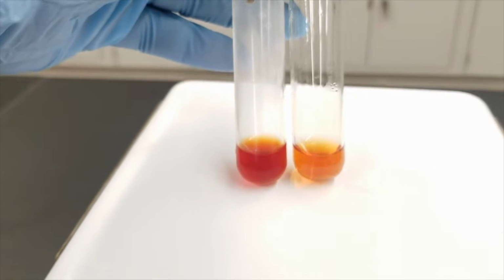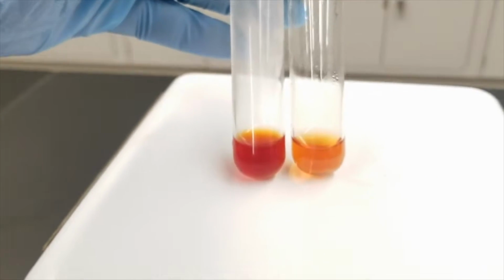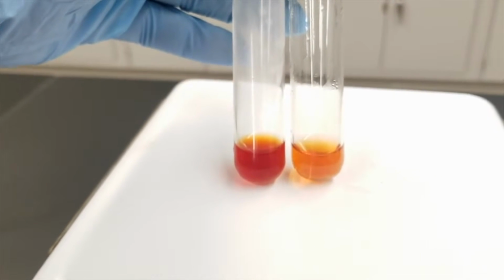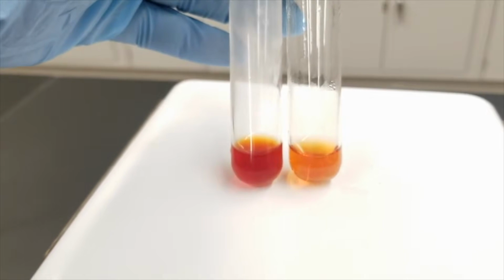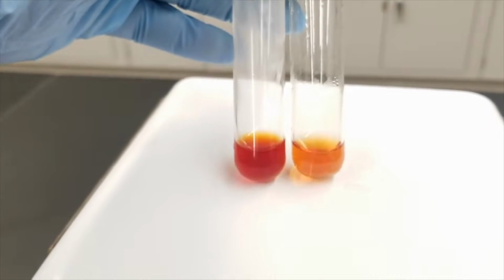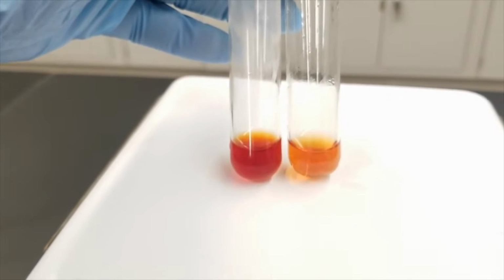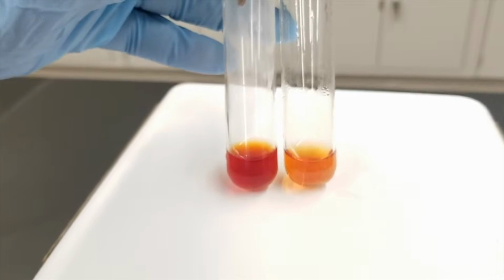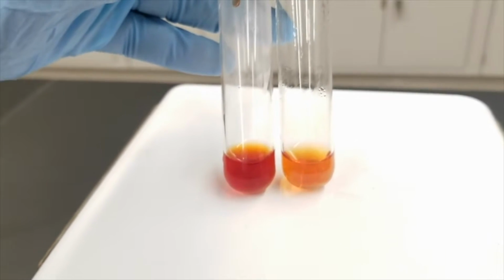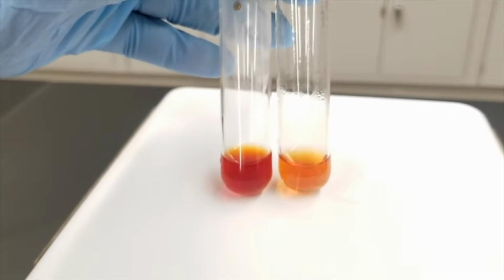So even though one of our test tubes hasn't gotten as dark as some of the other test tubes, I will point out that one of our reactants at least, iron 3 nitrate, is that sort of yellowish color, and our product, the iron thiocyanate complex, is a deep red color. So based on that, you should be able to figure out what's going on in these two test tubes.